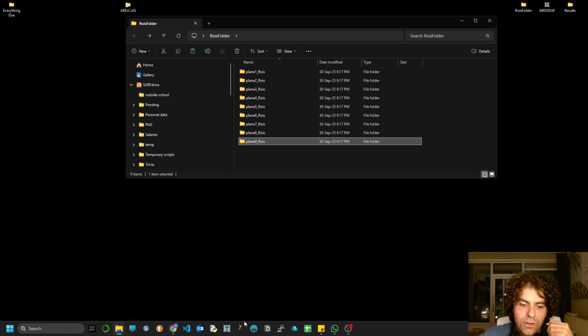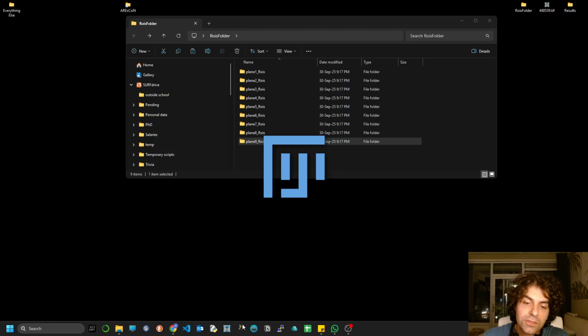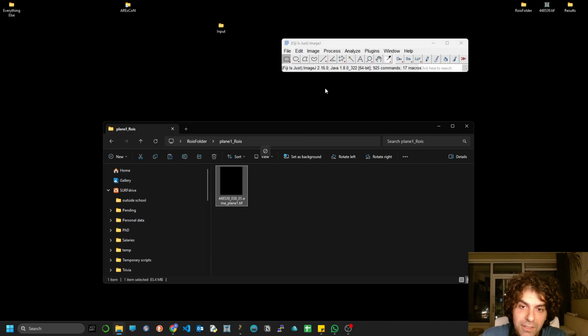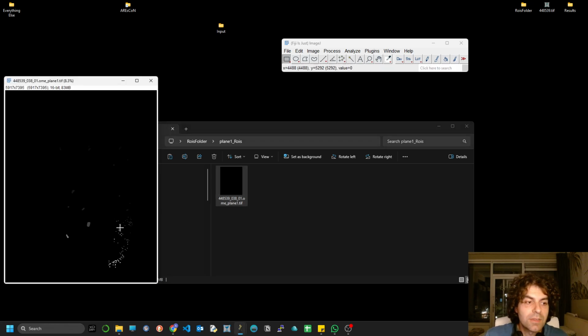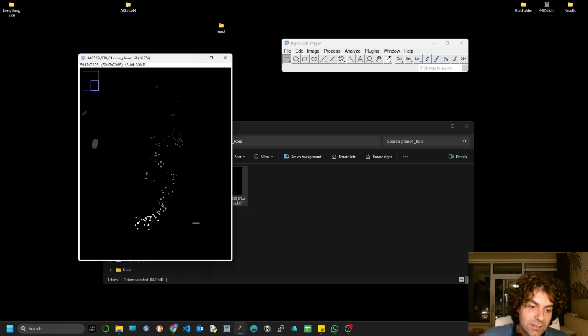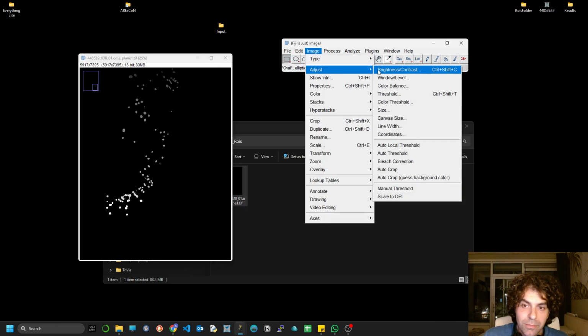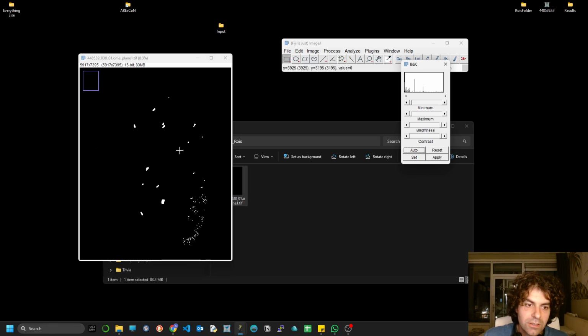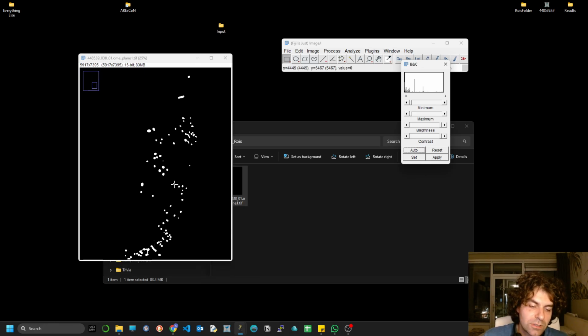So right now, to make things even more clear, you're having images with masks. This is how they look. This is all the acquired predictions, and there might be more than you see. Okay, so these are all the masks, all the predictions that were captured when we were scanning the first plane.